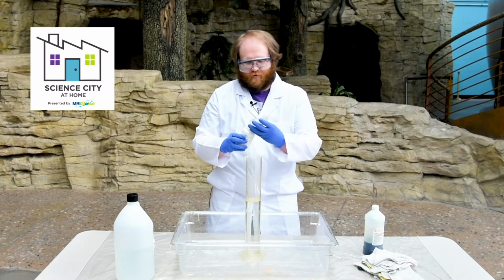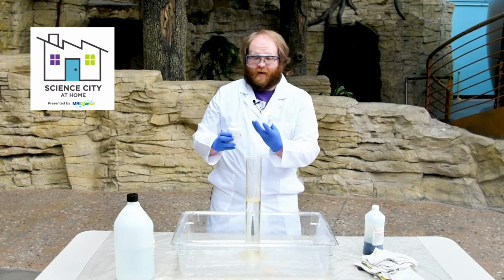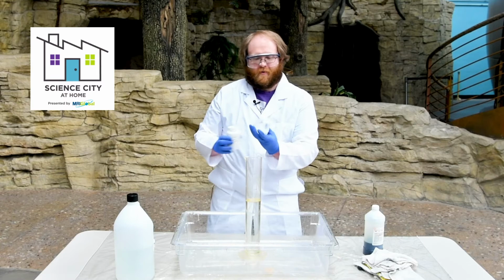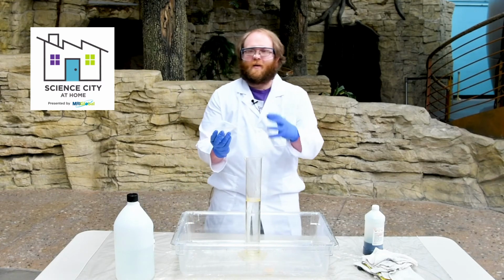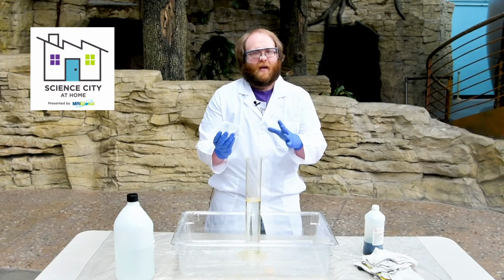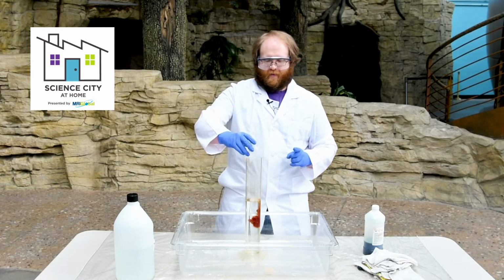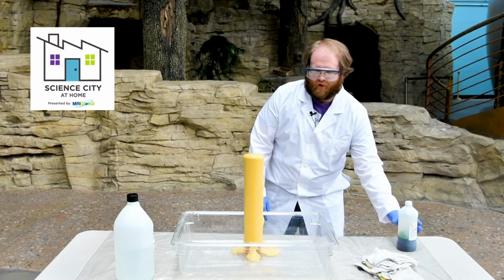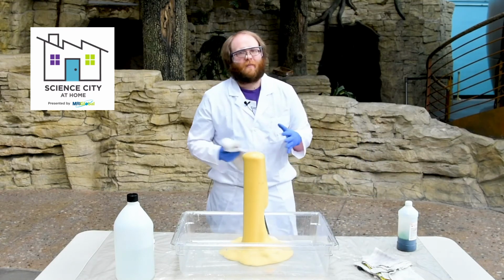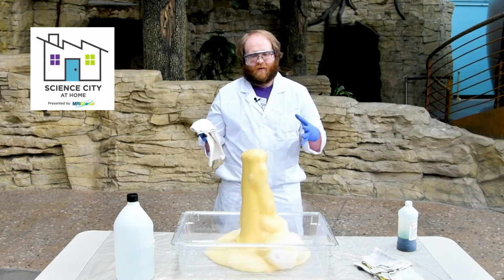Oh, that's way too much. I got a little excited. I put way too much potassium iodide in there. There we go. That's about all we need. So now let's count down 3, 2, 1. I'll dump this in and we'll see what happens. And here we go, guys. In 3, 2, 1, we add that potassium iodide. And it immediately starts to bubble up, it starts to boil over. And the thing about this experiment, it's gonna go for a long time.